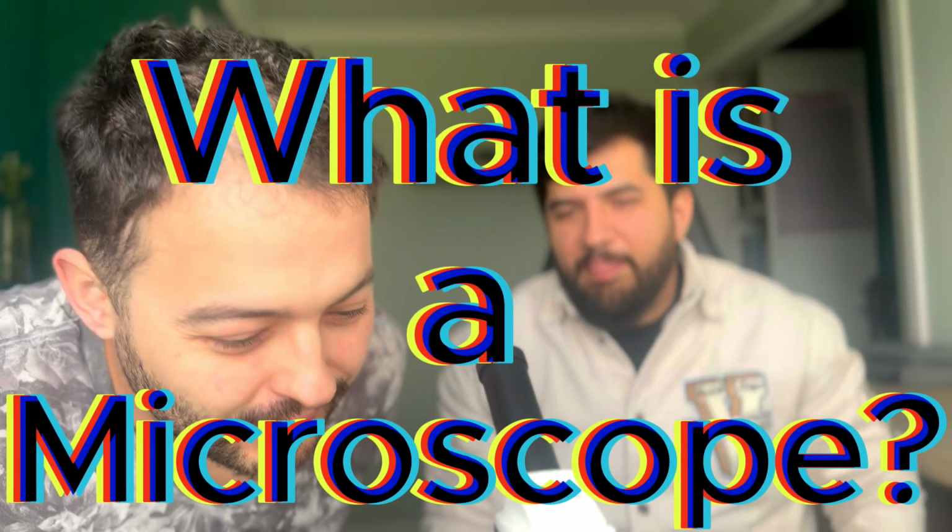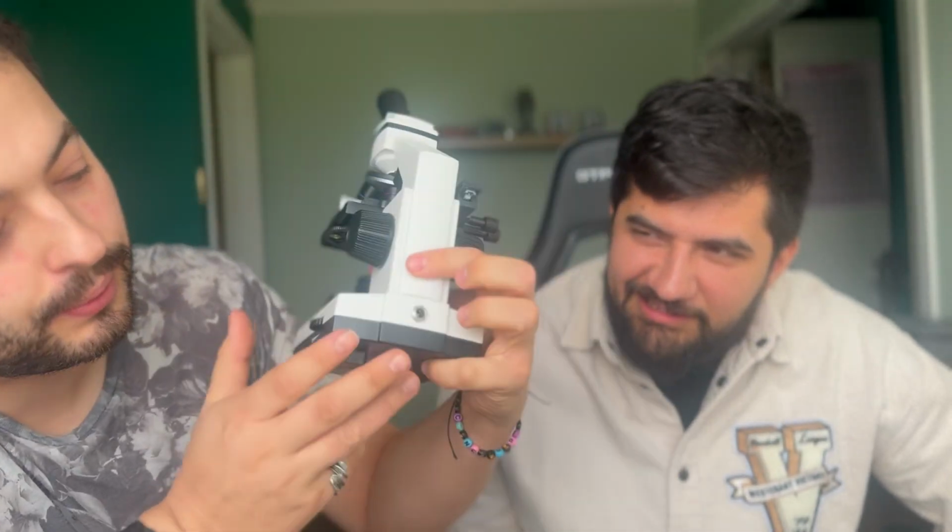Well, let's talk about what a microscope actually is. What is a microscope? The purpose of a microscope is to essentially refract, bend light. The reason why I've done an absolute, what we call in the chess world, a blunder, a massive mistake, is that we haven't got a little plug for this thing.